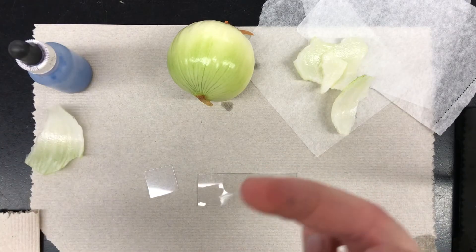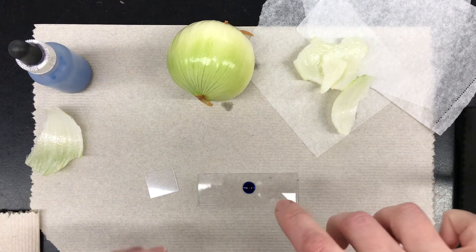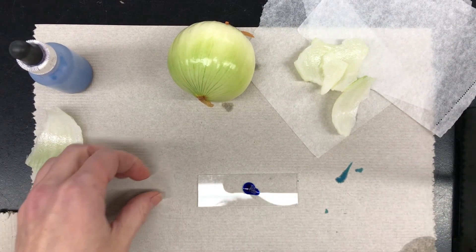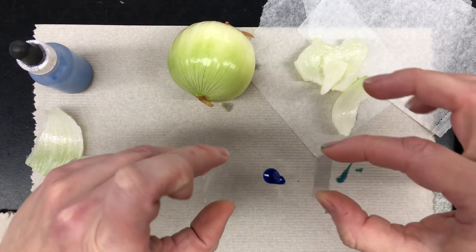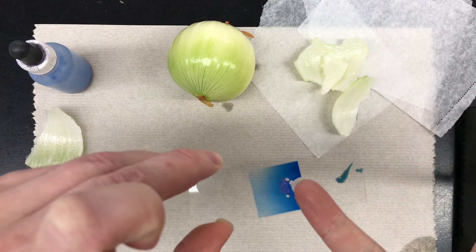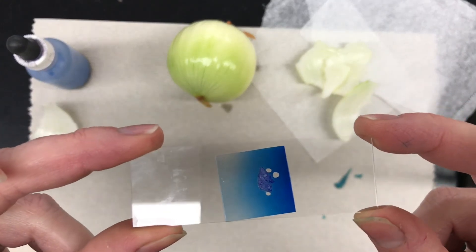Make sure that your onion skin, when you place it onto your slide, is nice and flat. You don't want it folded over — it'll make it more difficult to see the cells. Place it on top of the methylene blue. Take your cover slip, hold it at a 45-degree angle, touch the methylene blue a little bit, and release. You may have a few bubbles — make sure when you look at the slide that you're not drawing a picture of a bubble. There's our wet mount slide of onion cells.